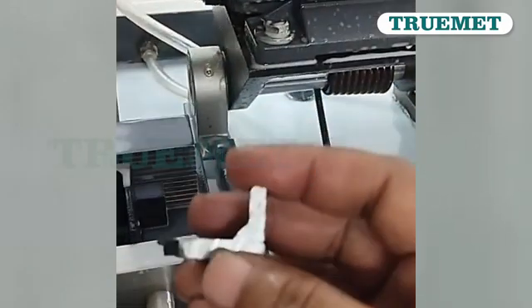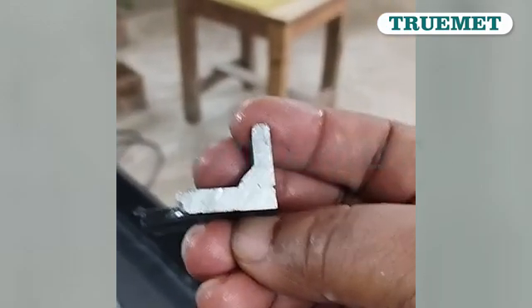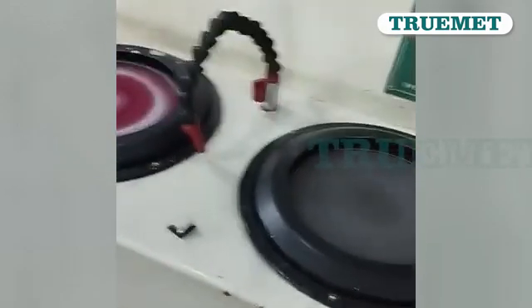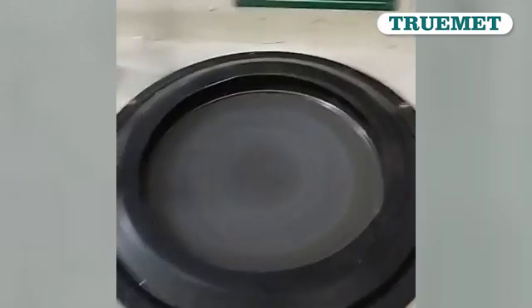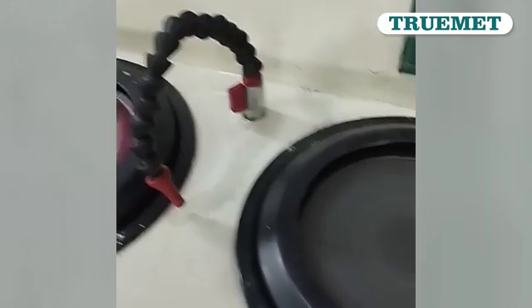Now we will move to our second process, that is the polishing of the component. After cutting the sample, we are moving to our second process, that is polishing of the component. So we are going to polish this component on this machine. Firstly we are going to use emery paper, then polishing cloth.